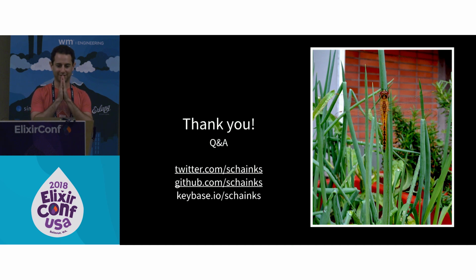I'm trying to think of how to answer this. Optimal, I think, depends on what you're doing. For me, optimal would be as often as I can, such that it would make the air in one room, or in my apartment, really clean. I think that winds up coming out to around once a week if I only want to filter CO2. If I want to just make it grow as fast as possible, I'll just feed it tons of sugar and then I can harvest every couple days, but it kind of defeats the point of the experiment, since I want as much carbon as possible to be coming from atmospheric air.